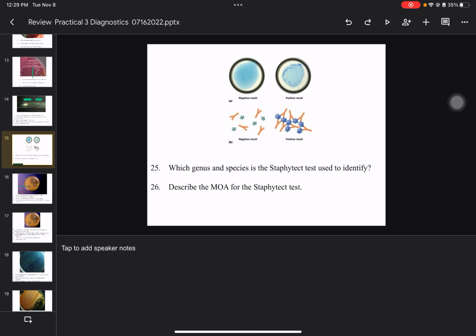I don't, because I've moved on. Why would I not bring you up to date? Coagulase is the gold standard, but it takes 4 to 8 hours, where we can do the same test as an antibody antigen reaction and take 4 seconds. So is the substrate still plasma? The substrate itself, what's being acted upon, is Staph aureus.